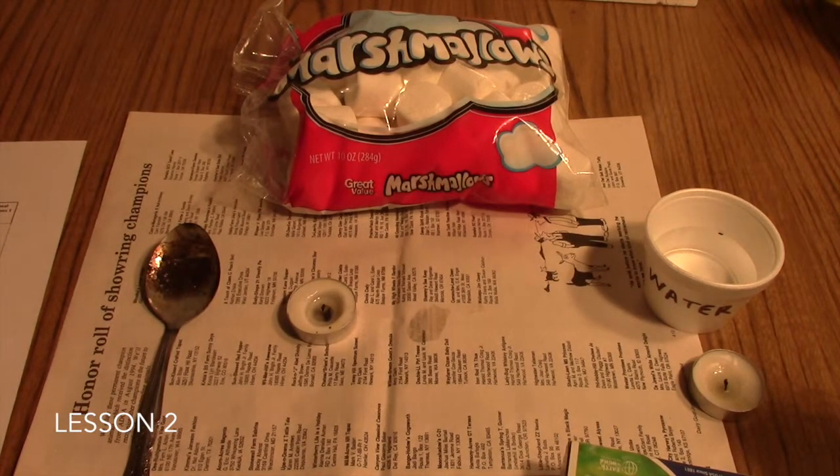This is the Marshmallow Inferno Lab. It goes with Lesson 2 in your Friendly Chemistry course. In this lesson, you will have been introducing your students to the idea of what an element is. In this lab, you'll take a marshmallow, which is a combination of several different elements, and reduce it to one single element: the element carbon.